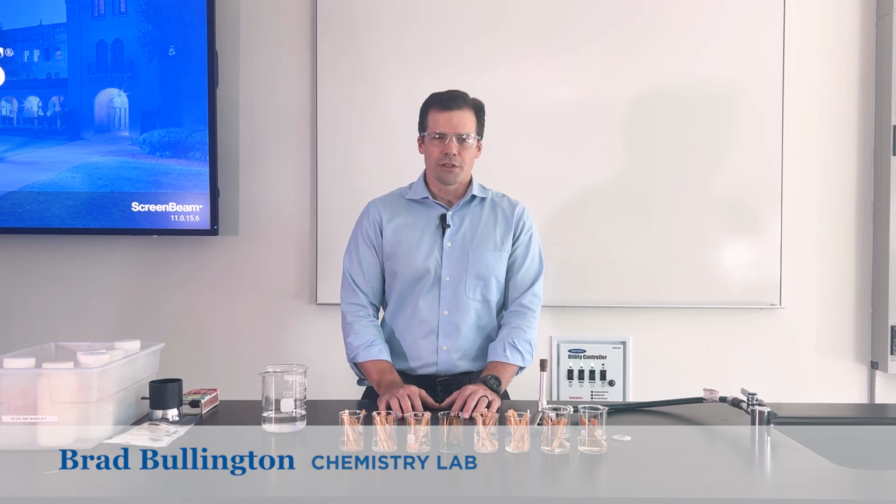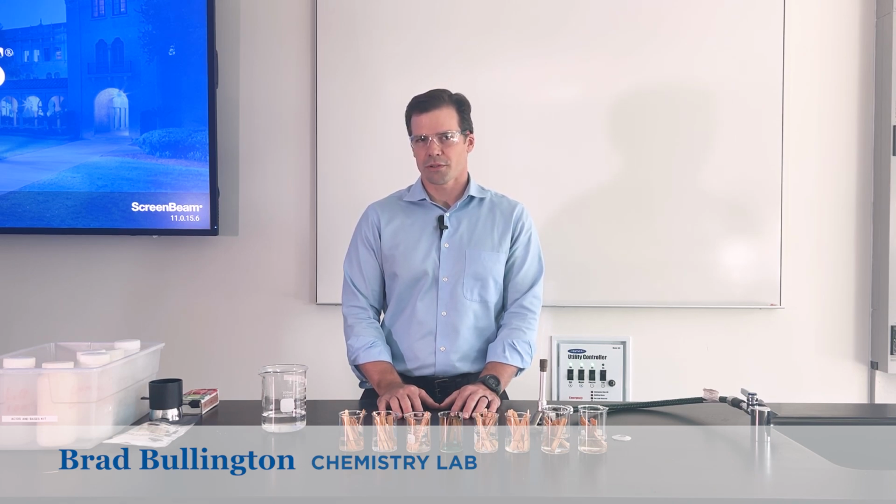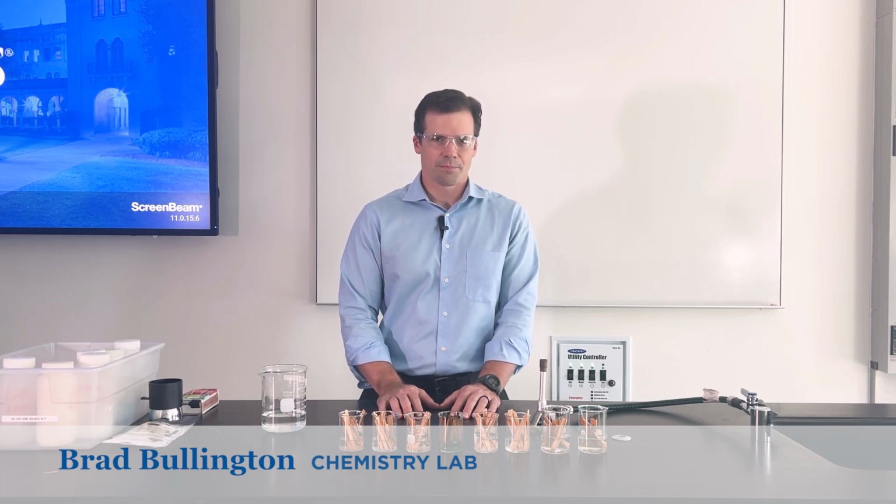Welcome to CFI 308. We use this lab for our chemistry labs. And today I'm going to be showing you an example of a lab that we do with our chemistry honors, chemistry AB, and chemistry AC, the flame test lab. In front of you, you'll see some cards. Those cards are of fireworks displays that are similar to the ones you're going to see tonight.